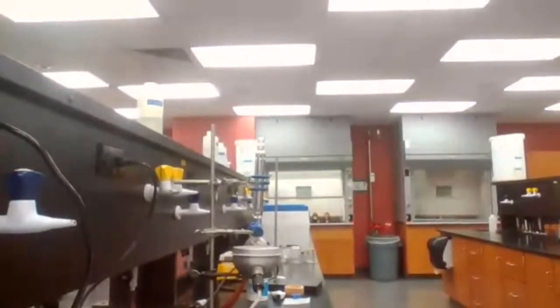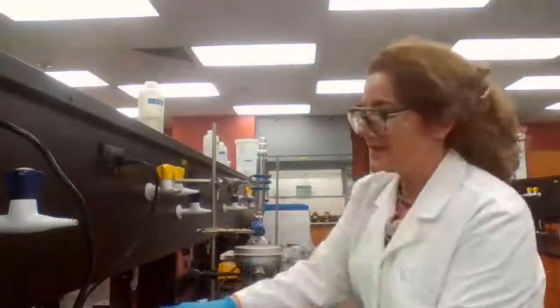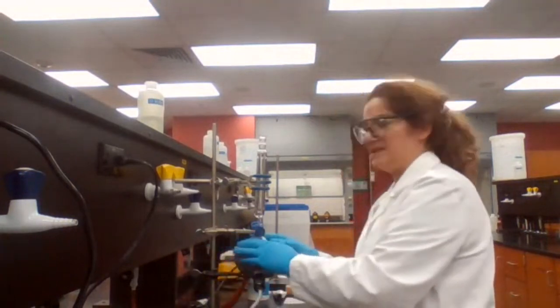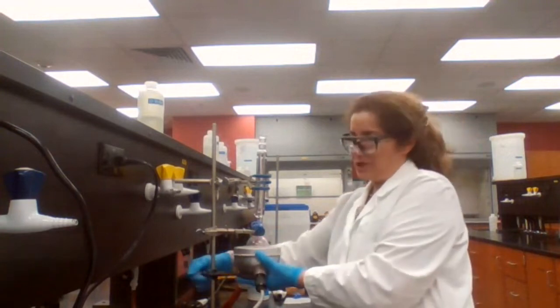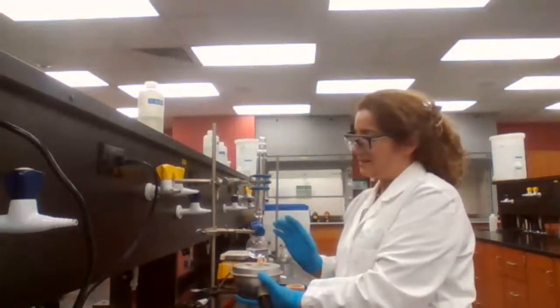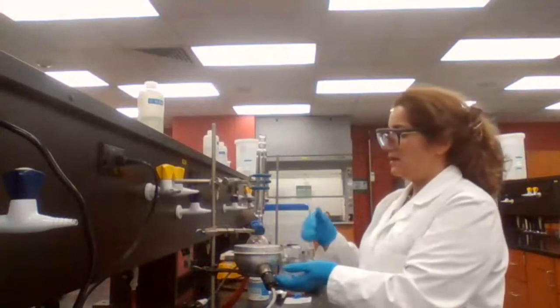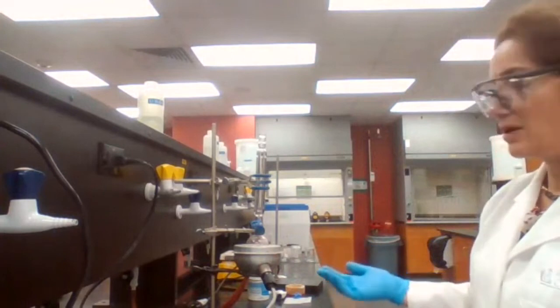Use the charger so it doesn't turn off like the other day it did. I turned on the heat now and I am going to set it up between 50 and 60, because it's methanol, it should boil quickly. And I didn't check if the heating mantle is working or not. It's better practice to check before you connect it and wait. You can just check this to make sure that it's working, it's heating up. So it is heating up. Just gonna let it heat up and start boiling. The reflux has started now.